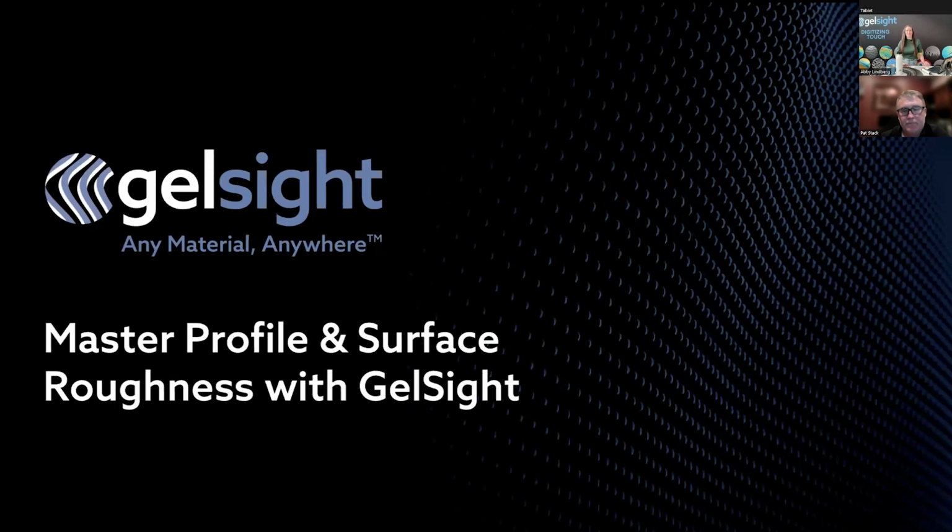So this webinar is the first in a series about surface texture and roughness. And today, Pat is going to get into what is surface texture, and then into some detail about the Ra parameter. We'll follow that with a live demo and Q&A. So throughout the presentation, feel free to use the Q&A functionality at the bottom of the Zoom window to send questions over.